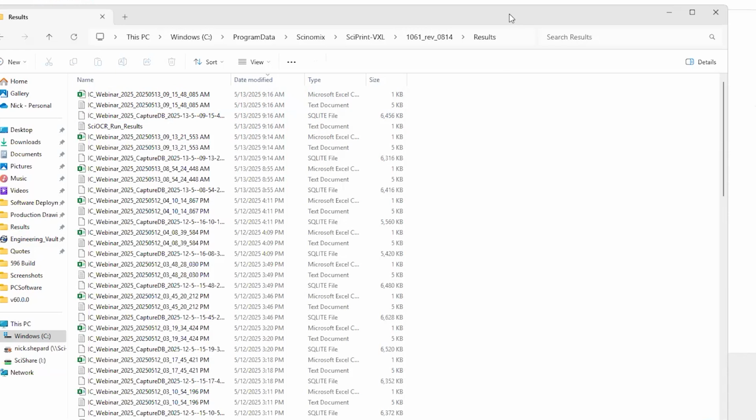Yeah, exactly. And you can do a mix of any of those kind of sequences, right? Maybe you don't need to do the alignment, but you still want to take the image of the printed label and validate it. You can remove that first initial scan. So what we're showing you here is basically the longest workflow, with the image capture module. We like to show all bells and whistles during webinars. Exactly. All right.